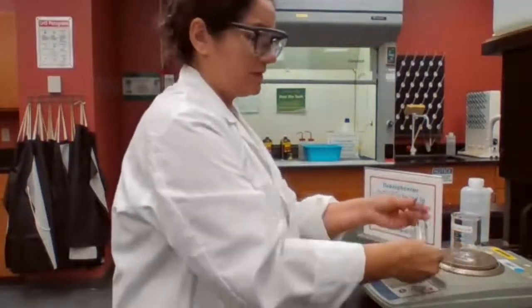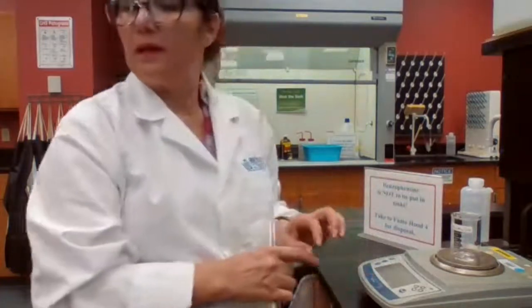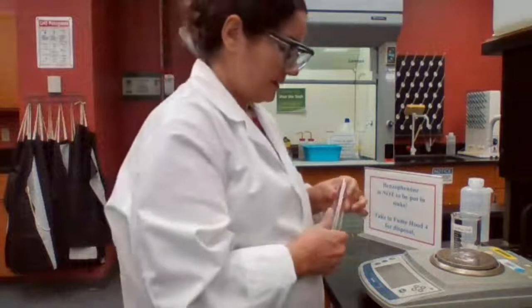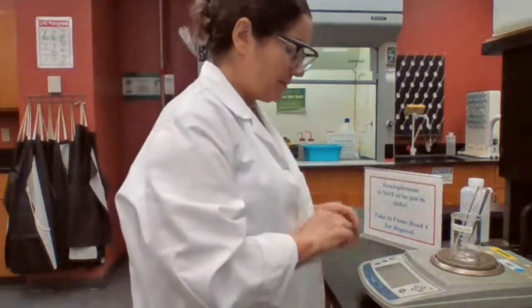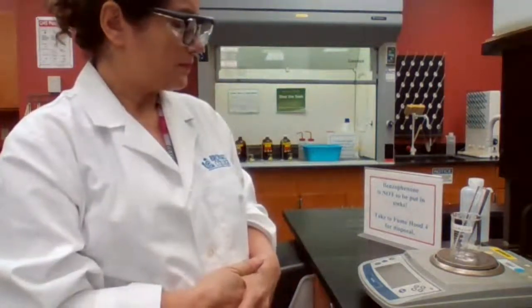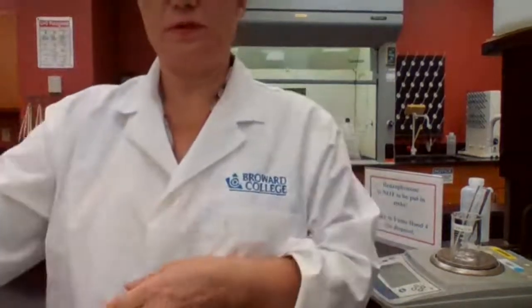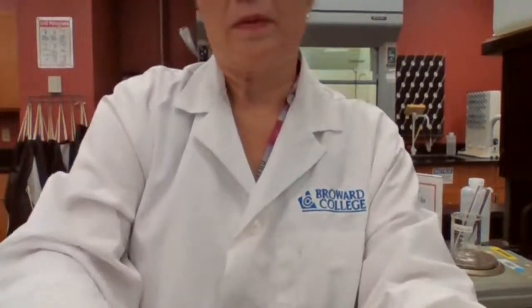I can't leave the test tubes on the balance, especially after I have the benzophenone in there. So I'm going to leave a beaker and place the test tube inside the beaker and measure the mass: 24.200 grams.